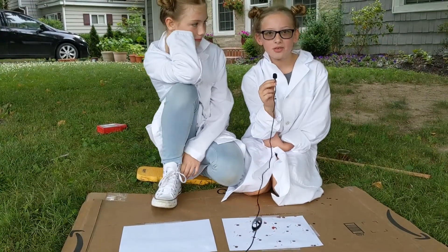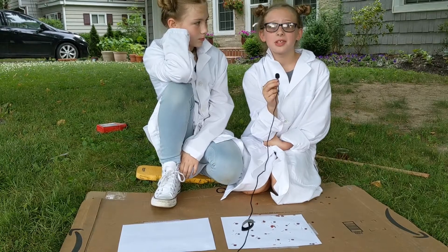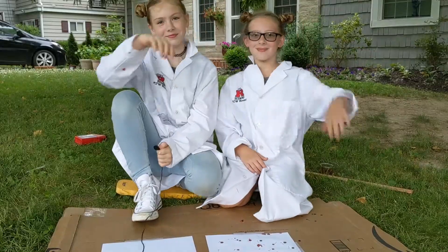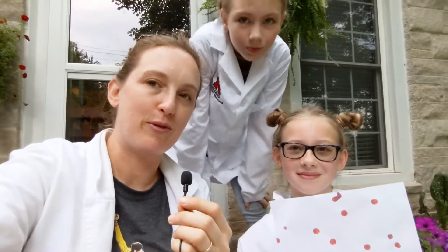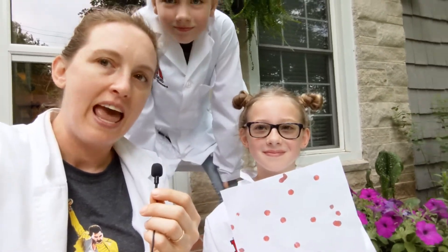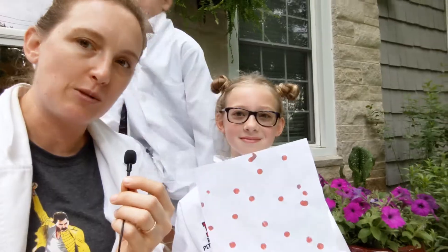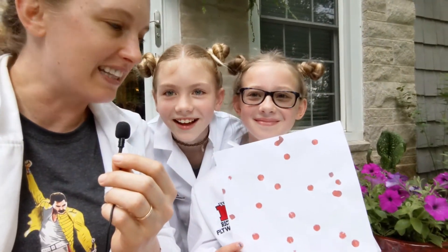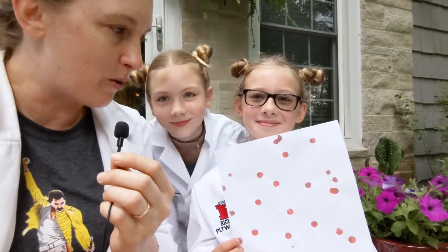Now we have 20 labeled droplets of blood spatter. I think we're ready for the next part of the lab. You will have to let your blood spatter dry a bit before you measure it — at least a few hours; overnight is awesome. And if you can't do this blood spatter experiment yourself, then go to the description of this video and you will see a link to a Google Doc of some blood spatter we did.